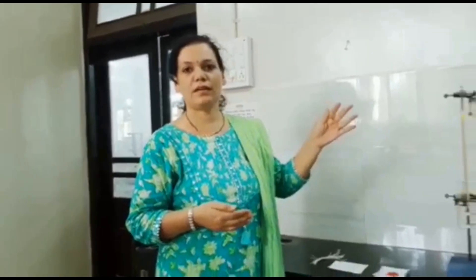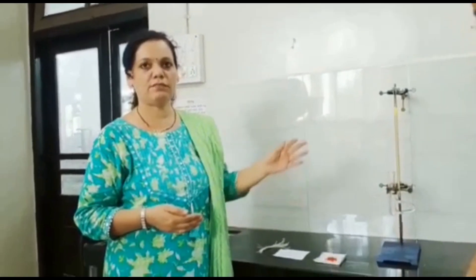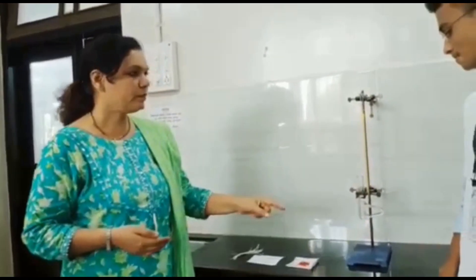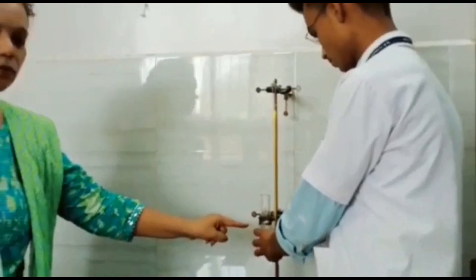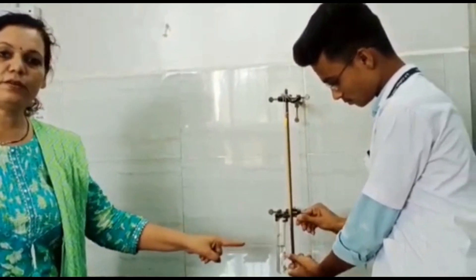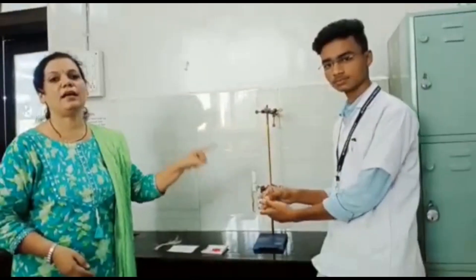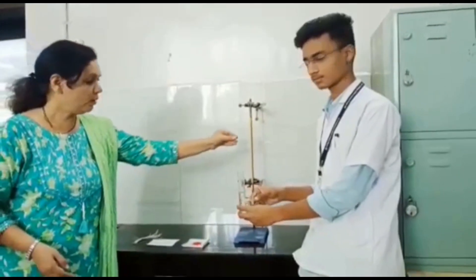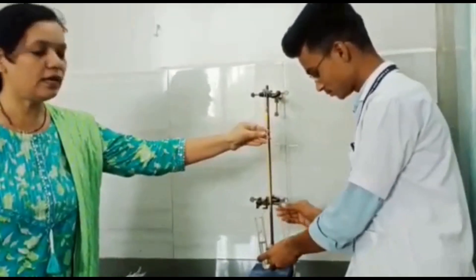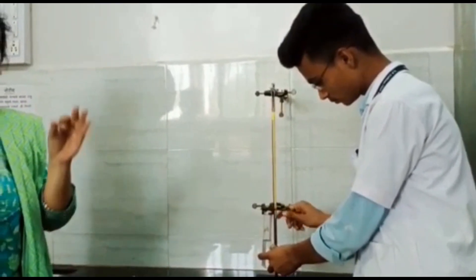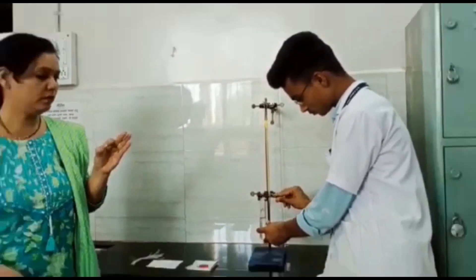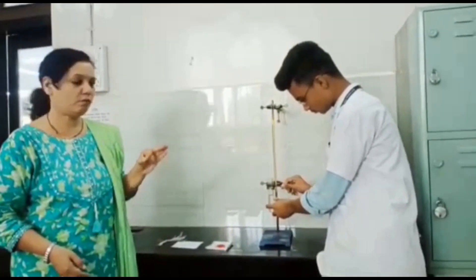Now we are going to see what assemblies we are going to utilize for today's experiment. Here we have the Thiele tube accompanied with paraffin oil, which has a very high boiling point. Along with this, we are going to utilize a thermometer where we can locate the exact temperature of the melting point.